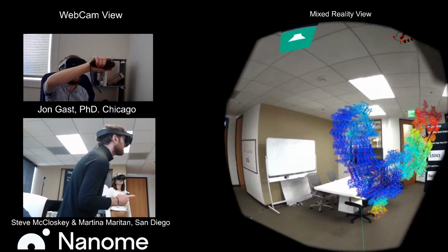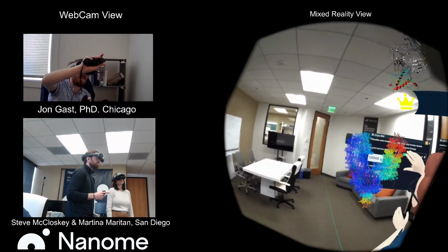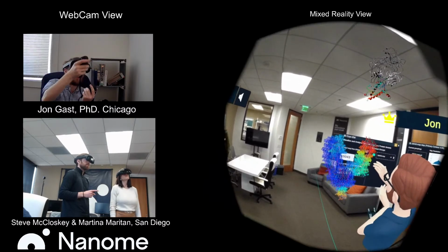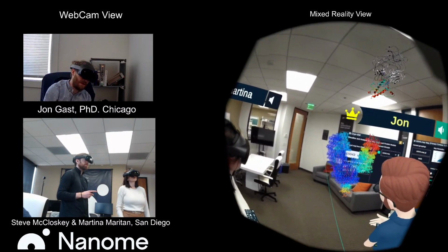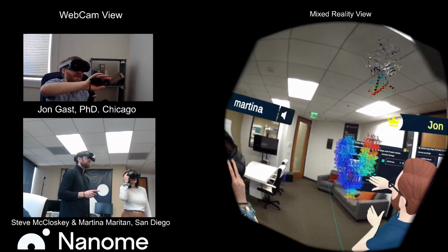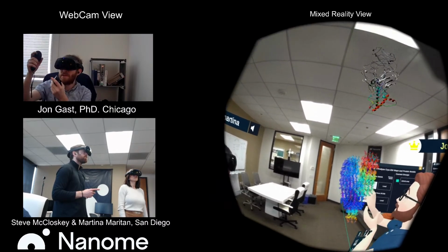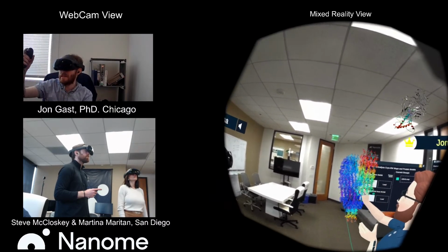And even looking over here at the B factor data over top of it, we can see there being much more space around things that are moving more and are just not quite as still. And so there is a bit of understanding of what some of these numbers mean when we look at them in a table. What do they mean physically? What do they mean in 3D?